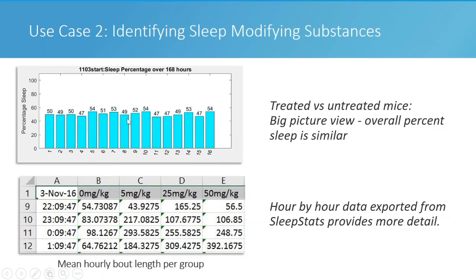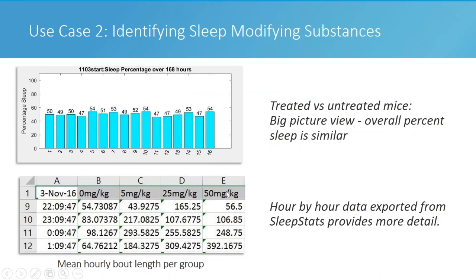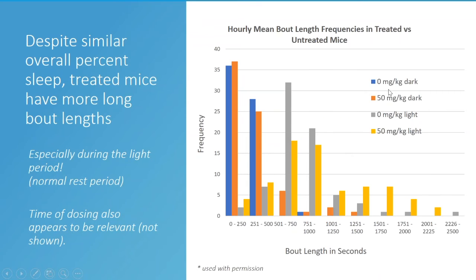So initially we got our basic total sleep times, not much different. Not shown here, but the day-night sleep times also not much different. But then we wanted to look at, did it affect fragmentation or consolidation? So in this case we start with hourly values. In this case we started at 9 minutes after an hour, so the hours are all consistent with that. And we take our output of that hourly data and we can export that to Excel. We can plot that automatically, and now we can look at, let's say, maybe I'll go back. So there were 4 doses of 0, 5, 25, and 50 mg. Just to keep it cleaner, I'll show just the 0 and 50 mg, which had the biggest effect.